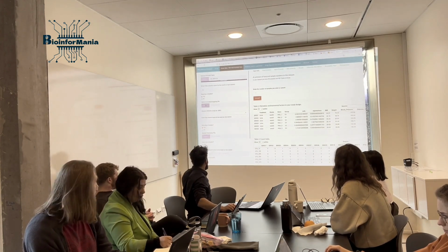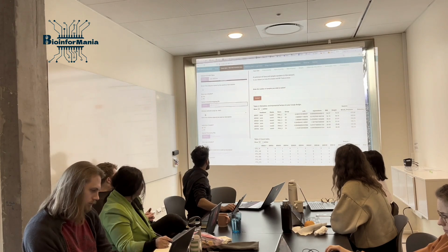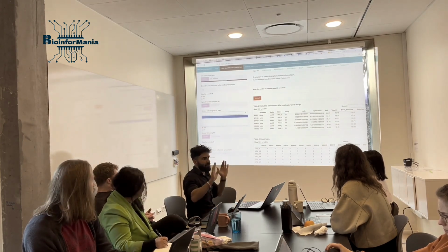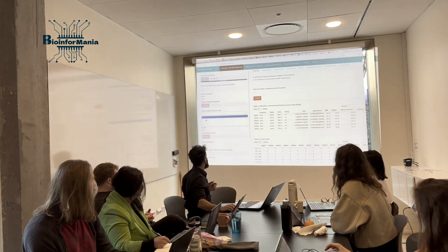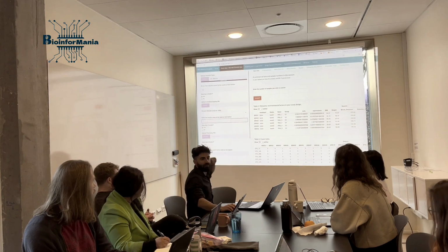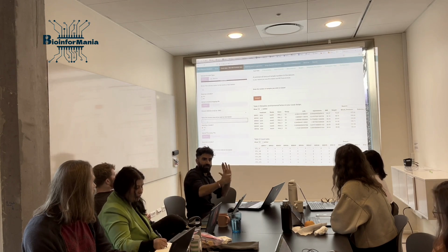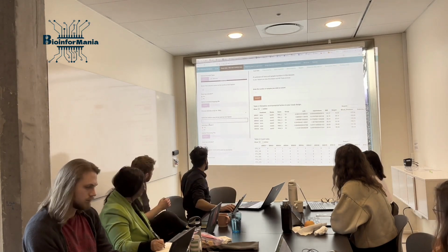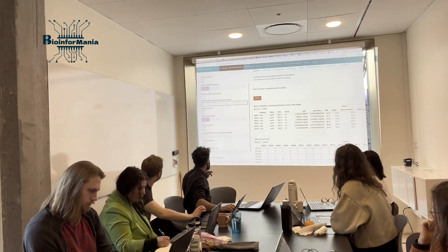Metadata, again, you load it, and if it's CSV, that's the one. CSV files, TXT, no problem, but if it's a CSV file, you need to know your delimiter. Is it comma, is it semicolon, whatever. And then you just choose it, and then give the name of that column that you want to use as the row name, the sample name, in this case ID, whatever. And then data has a header, yes.